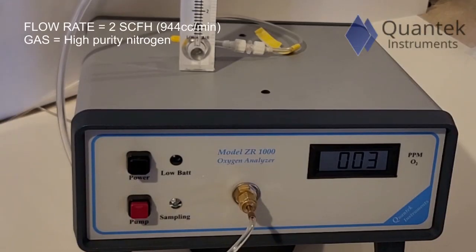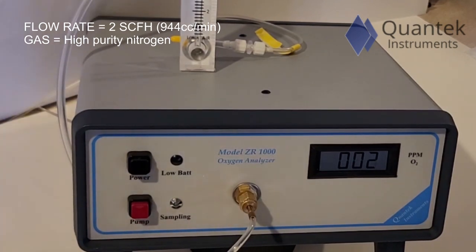And finally, we'll flow high-purity nitrogen through the instrument at 944 cc's per minute. As you can see, we reach the expected value of zero to 2 ppm.